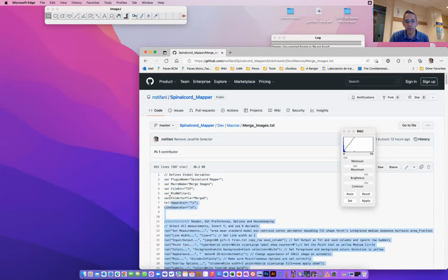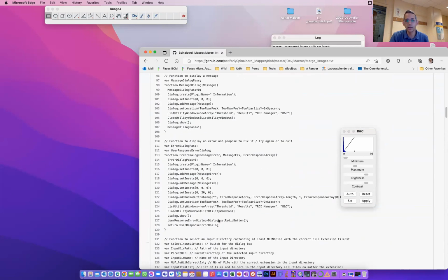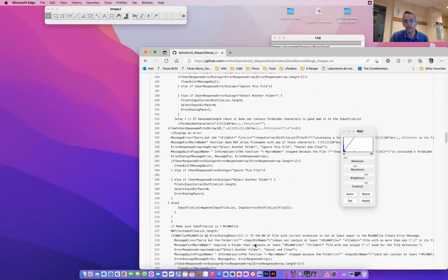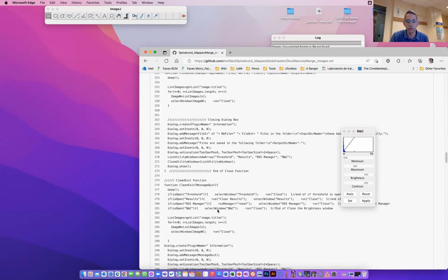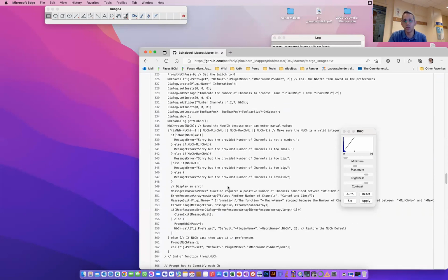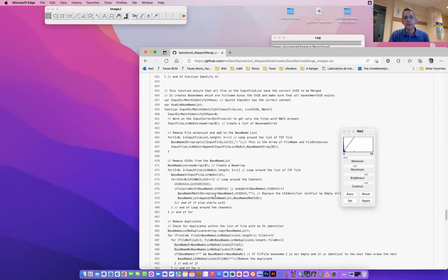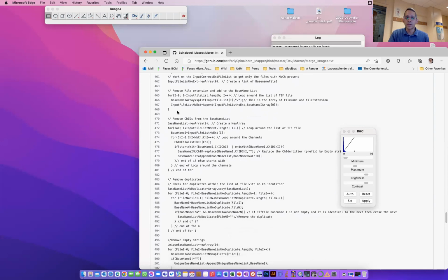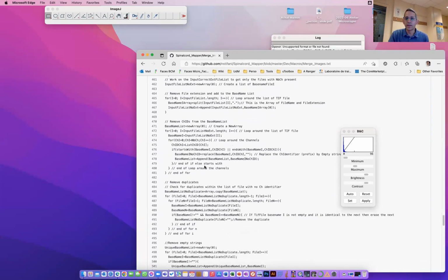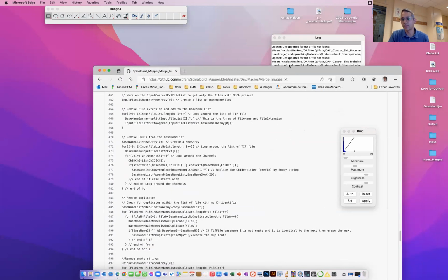So you can actually just copy that, or copy part of it. I usually write precisely what each function is doing. So you can take this part of the code, or copy and paste some section. I don't want to go into the details because it's a very complex code for doing something very simple. But in this case, it has to look for patterns in the names of the files to find the files that have the same name with a specific suffix, and then merge everything together.